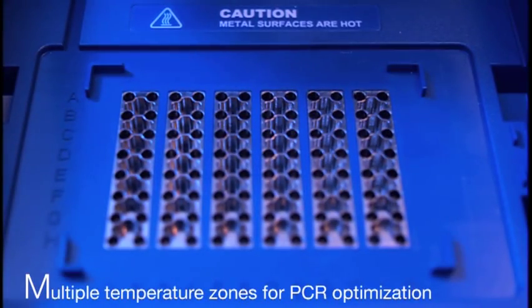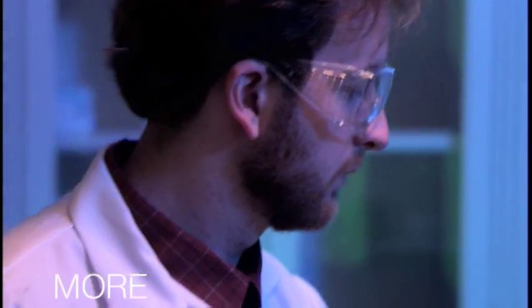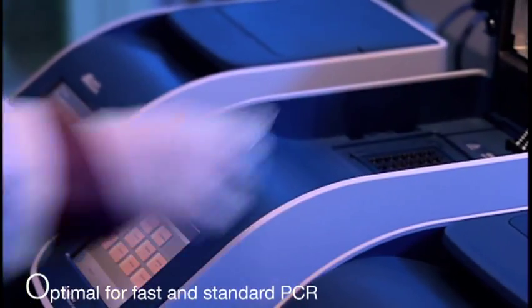Multiple temperature zones for PCR optimization. Optimal for fast and standard PCR.